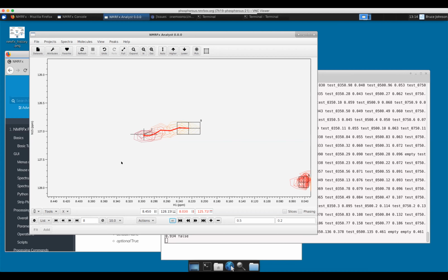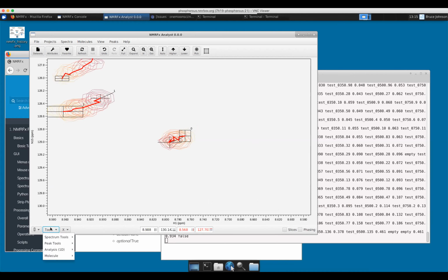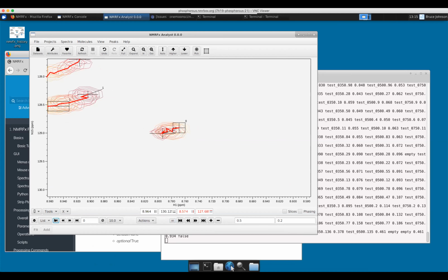So that's very similar to that dialog box I was talking about, right? It gives you the curve plus also a table. Exactly. I've tried to keep this fairly similar to NMRbox to be user friendly, and we've tried in theory to make it better, but not working at all is definitely not better. I'm kind of baffled because, like I say, it worked yesterday, and I see no reason why.